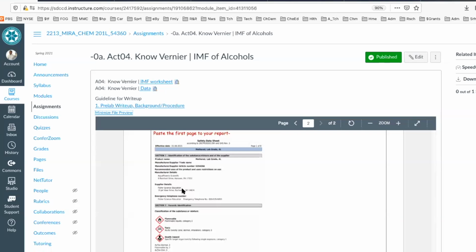And then don't forget to write in your own words the chemical that's being used, the quantity that's going to be used in this experiment, and how we are going to dispose of the waste. Yes, it's sort of funny how you should write that when everything's virtual, but hey, amuse me, because when things get back to normal, hopefully this fall, you guys are going to have to know how to handle these chemicals and the proper disposal technique.